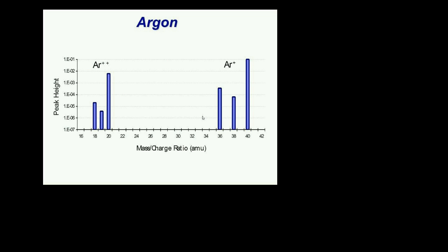Do it at least once. Figure out what that spectrum looks like. Print it out and put it on the wall as a poster so you know what your system looks like. And update that poster maybe once a month or so. Then anything else that you add into the system, the only stuff that is real is the stuff that is real relative to that background, subtracting that background spectrum that you know about.